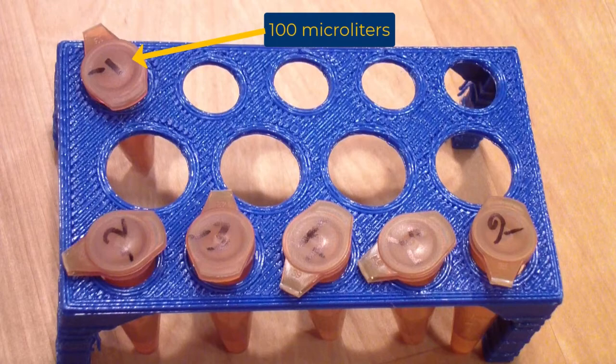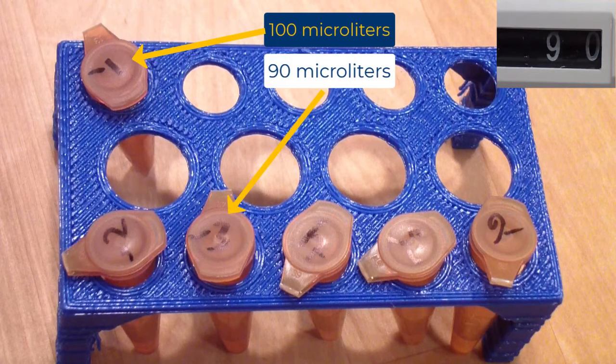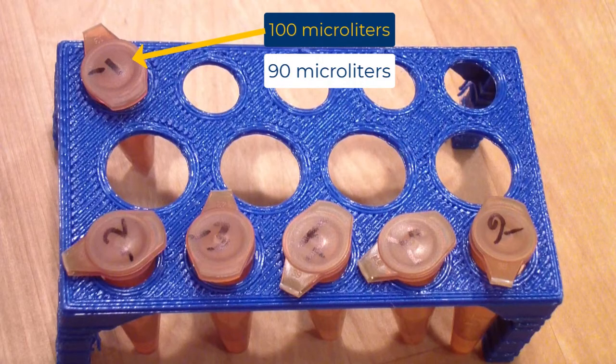You will then pipet 90 microliters into each of the remaining Eppendorf tubes. You may use the same tip for this step.